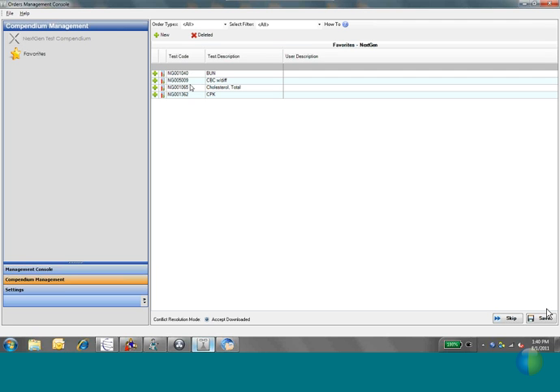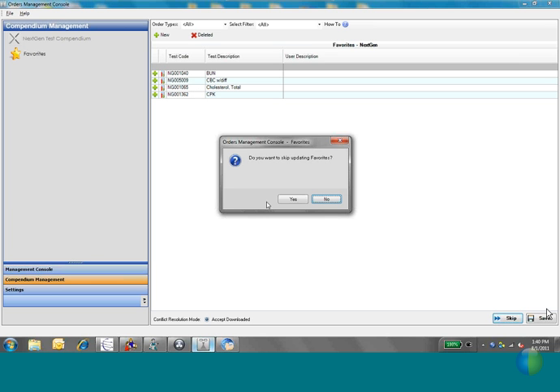Then what it did is it moved on and it added to the favorites list. This is, if you look on the left, it did the NextGen compendium first, and now it's doing the NextGen compendium favorites. And I only have 4 in here because I have a test server, but if I click that I want to save this, it'll download these 4 into a favorites list. You can also skip the favorites because not everybody does favorites. So you can skip that.